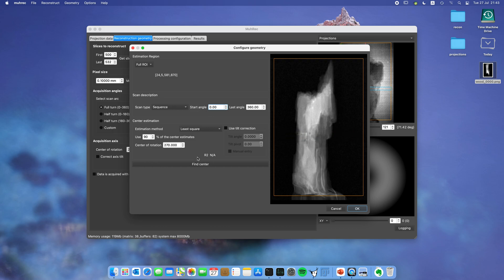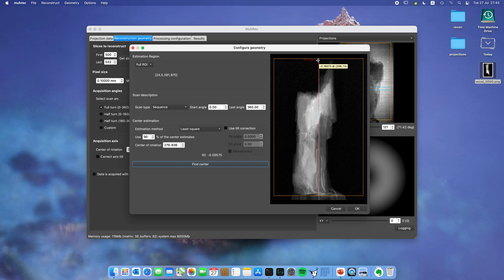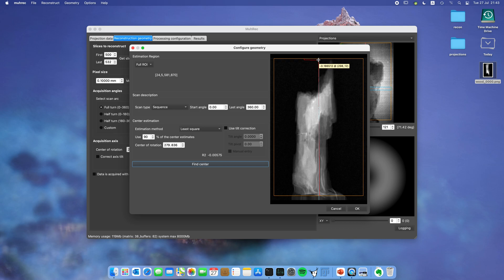Here you have just find center. Click on that and you can see that all the red dots correspond to the center that was found for each slice in the image.